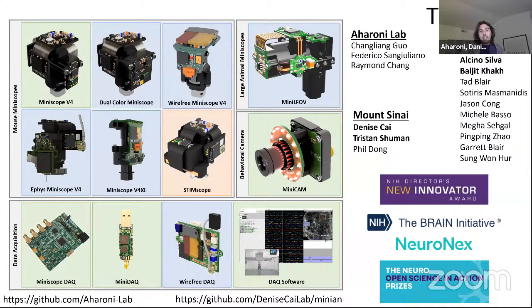They are really pushing this idea forward, and they provide kits or fully assembled miniscopes, not just our stuff. They provide other open source tools as well, but also warranty and support. If the lab has the money but not the resources or manpower to debug a system, maybe a commercial approach is fine. But I also like the idea that if you built a miniature microscope, it's yours. You own the thing, you understand what went into it, so you can design your experiments better because you understand the capabilities of the system.